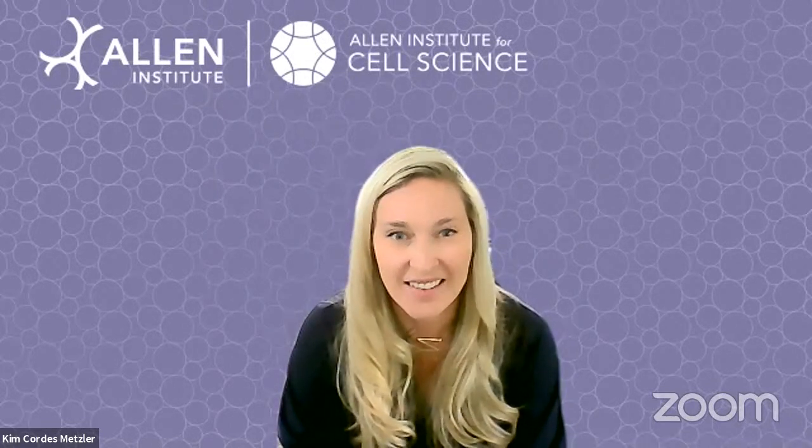Awesome, thanks. And I'll just add to that: if there is a specific edited line that you're interested in for your lab, and you want to make sure that the imaging capabilities that you have are sufficient for that, go ahead and ask those questions in our forum. We have the scientists who have been imaging those lines and can give you a little bit more information about what specific specifications you might need.